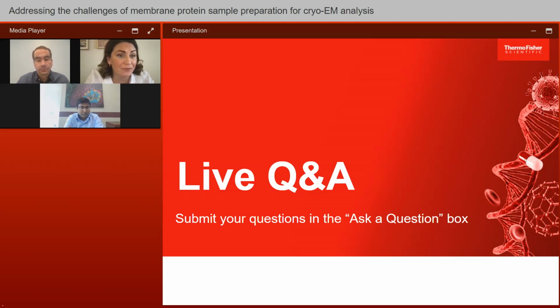That's a great question because it is an issue. I know we always talk about how we don't need much protein for cryo-EM, but when you're trying to decide these ratios and the lipid composition, you really want to perform a screen. That's going to be more achievable if you have more protein, although we do it on a smaller scale.